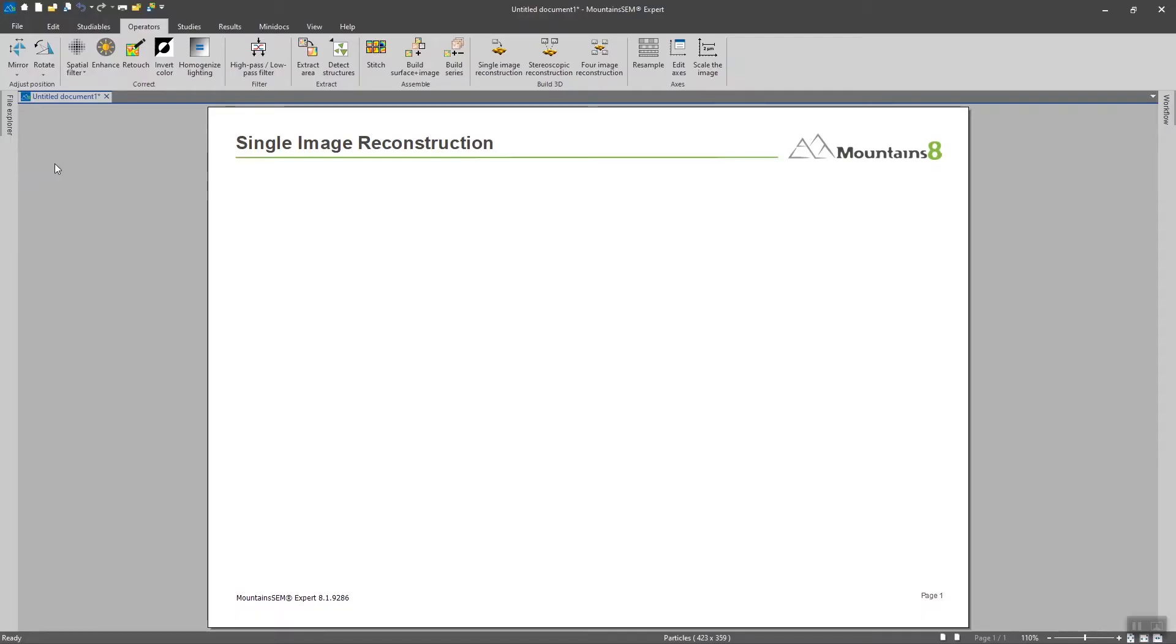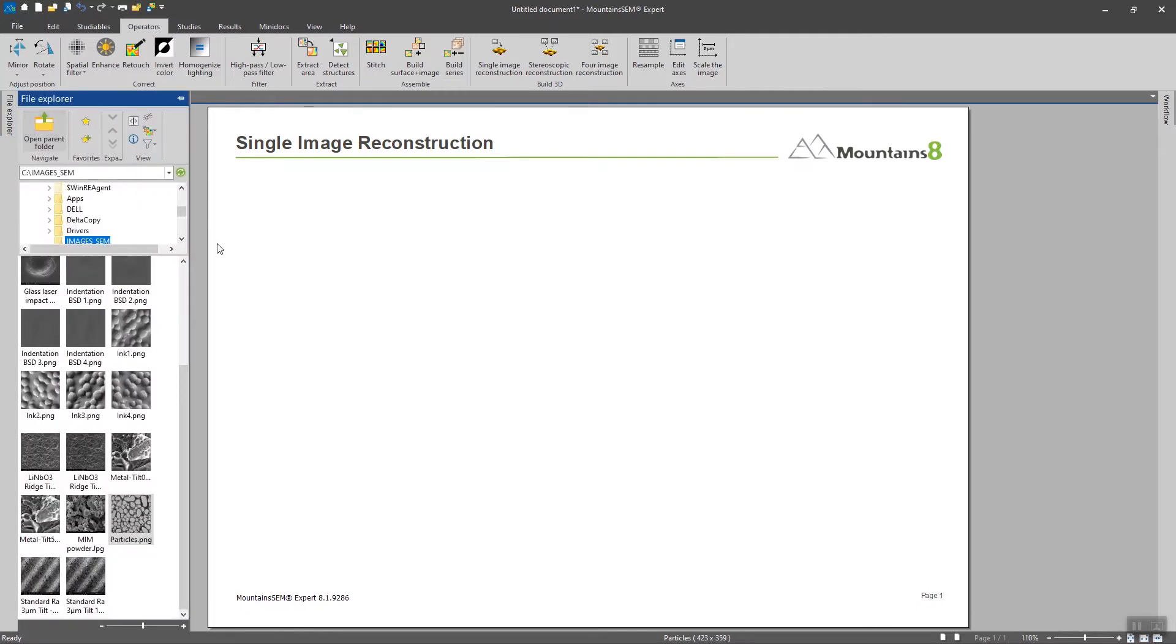Okay, so we are going to explore the various tools that Mountains SCM gives us in order to get the 3D rendering out of only one SCM image.